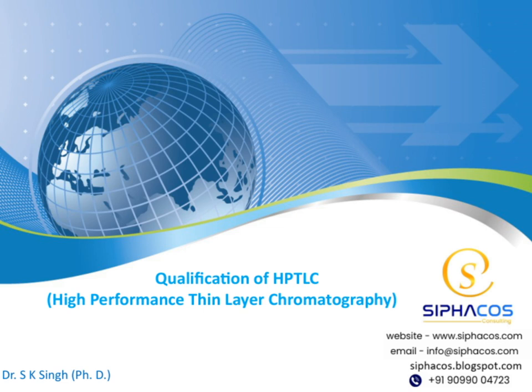I'm Dr. S.K. Singh, and I'm excited to share with you insights into the qualification of HPTLC, which stands for High Performance Thin Layer Chromatography. In this session, we'll explore the fundamentals of HPTLC, its significance, and how it is qualified for various applications. Let's get started and delve into this fascinating topic together.